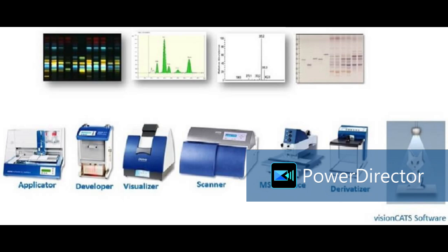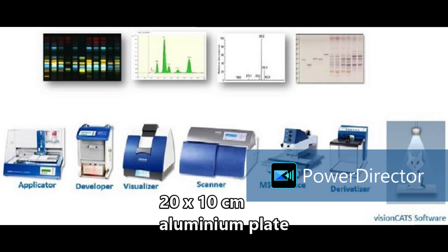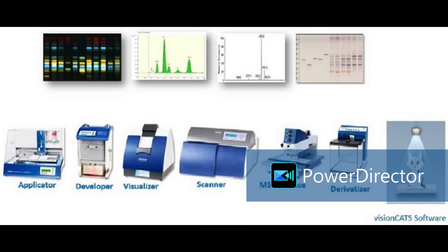We are running it up to only 7 centimeter, 70 mm. We are taking a 20 by 10 centimeter plate. That is the standardized dimension of the plate. In the conventional method there is no standardization; anyone is cutting the plate. Are these pre-coated ones, or do we need to prepare them?